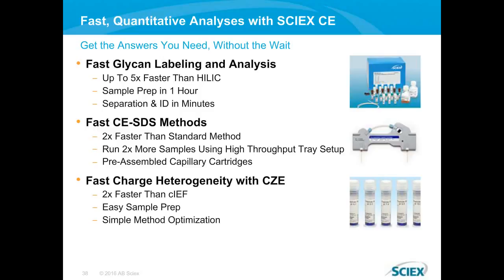There's a couple of caveats, though. One of the things I would need to follow up on is what sort of glycan your antibody binds. Is it an N-linked oligosaccharide? Is it some other kind of glycan? Is it a monosaccharide, for example?